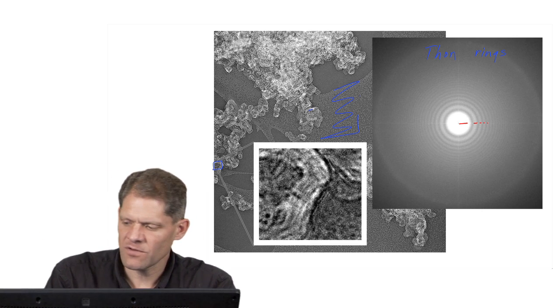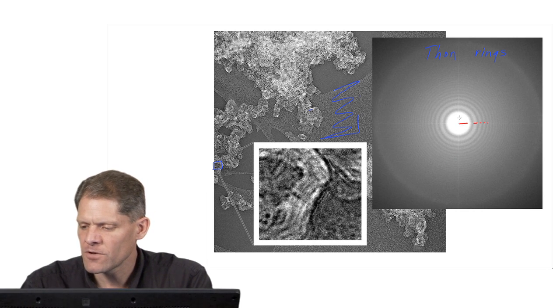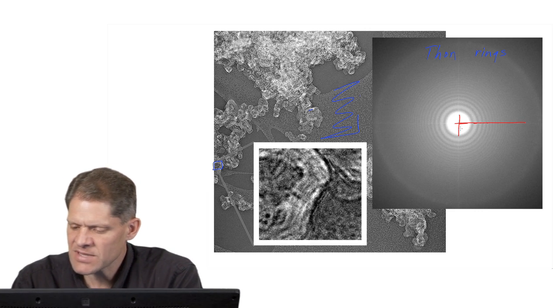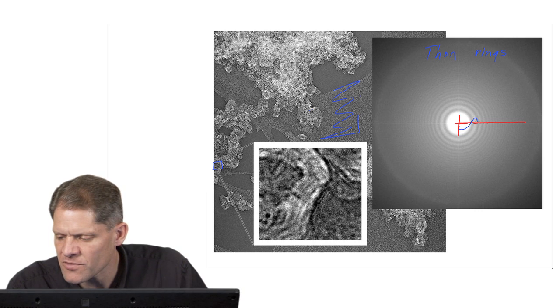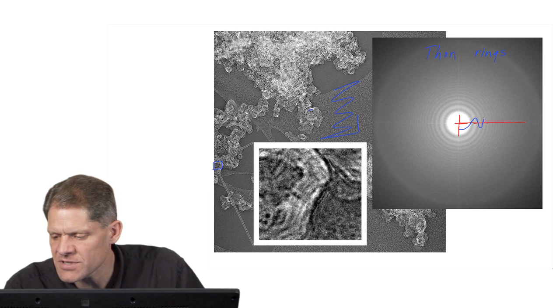And this, of course, corresponds to a CTF curve. If I were to plot a CTF curve along this same axis, what it means is that there was strong signal throughout this region, and then there was no signal at that spatial frequency, and then there was some signal at these spatial frequencies, and again passing through another 0 in the CTF, and then strong signal to another 0 in the CTF, strong signal, another 0.